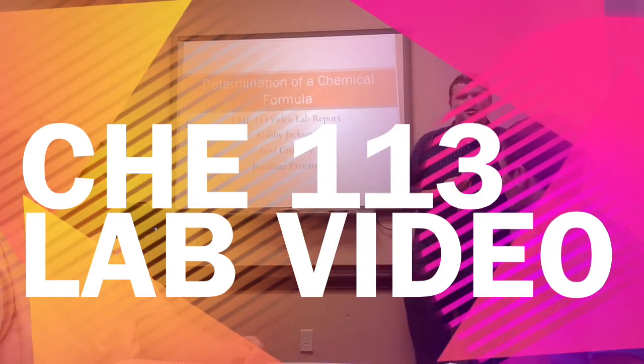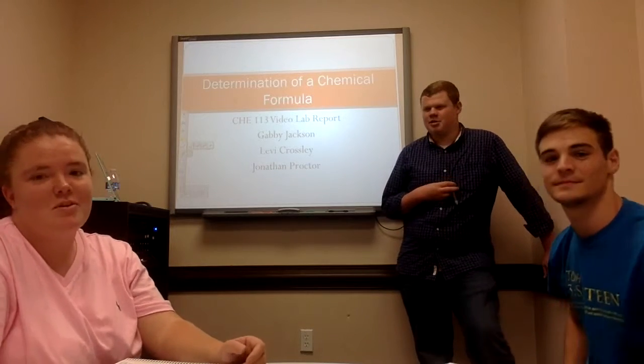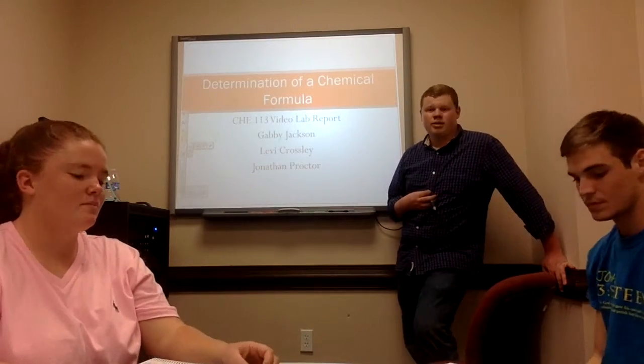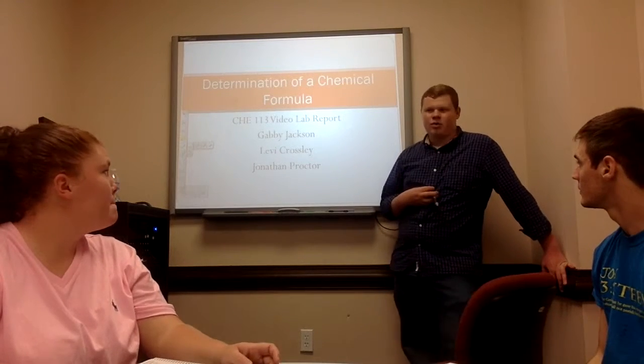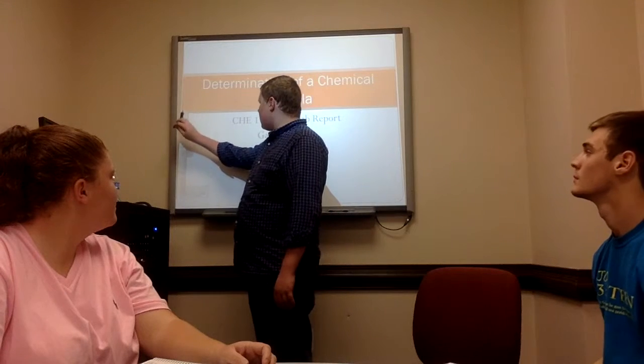I'm Dr. Proctor, subbing for Dr. Mullins today. I'm Levi Crossley. And I'm Gabby Jackson. And so this is our video lab report for experiment 3, determination of a chemical formula. So, let's get to it, class.